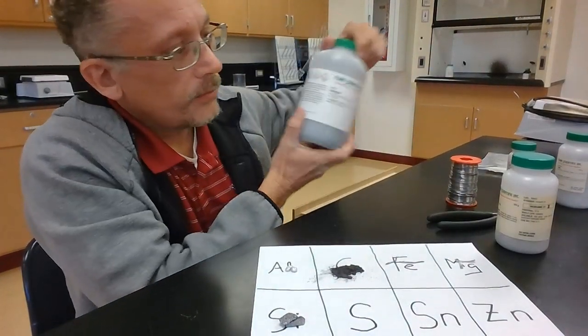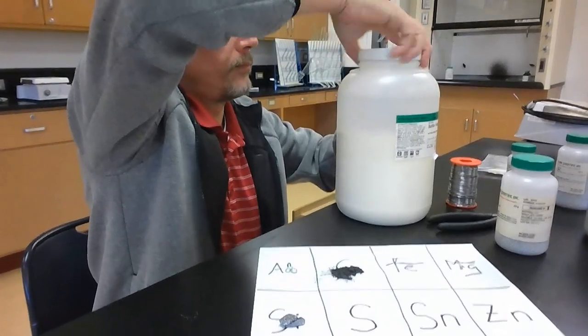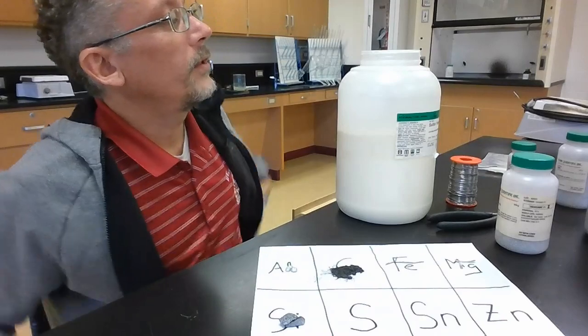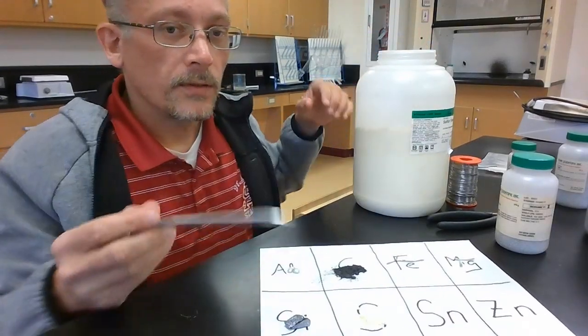Next we got some sulfur. Here I got a whole bunch of sulfur. I'm going to take my spatula and get a little bit of sulfur. This is a powder. A little bit of sulfur.